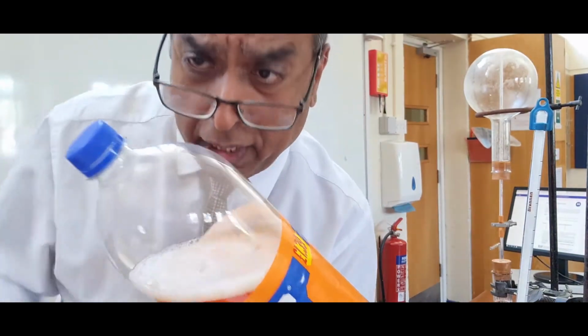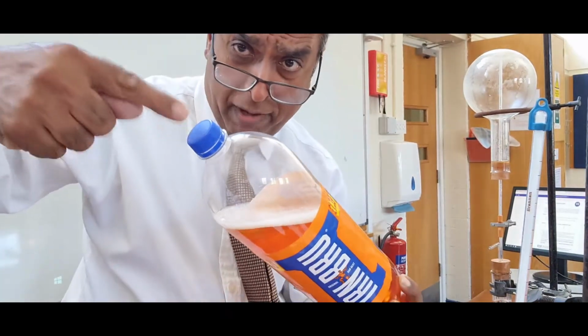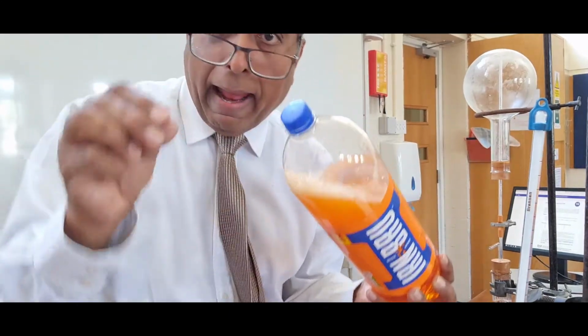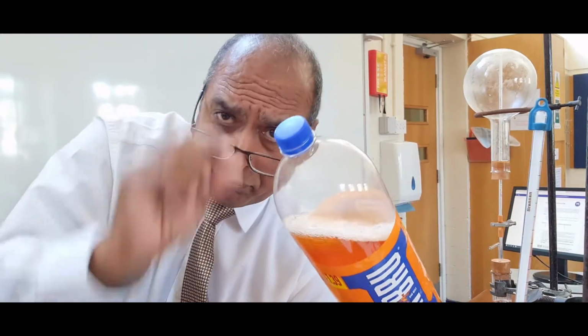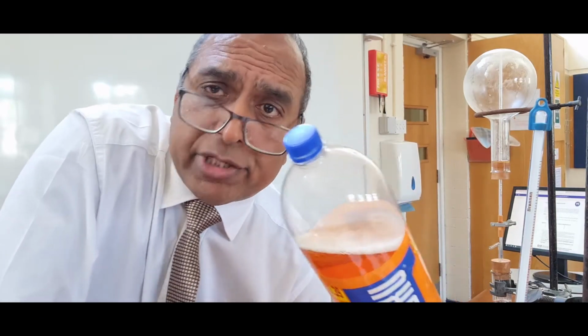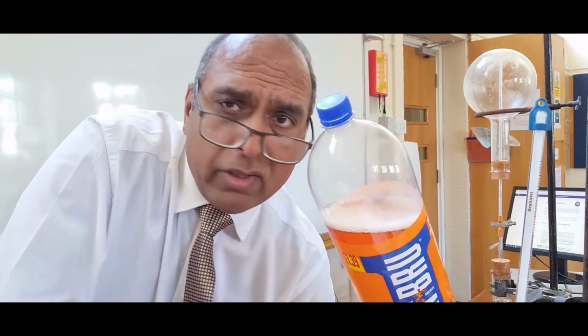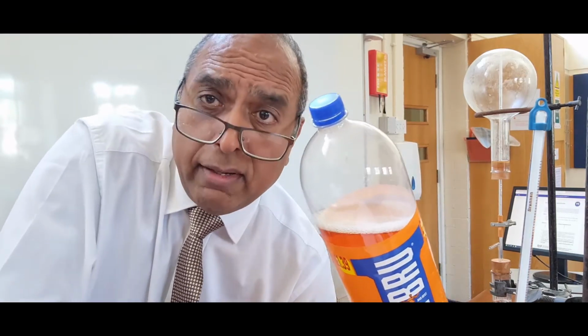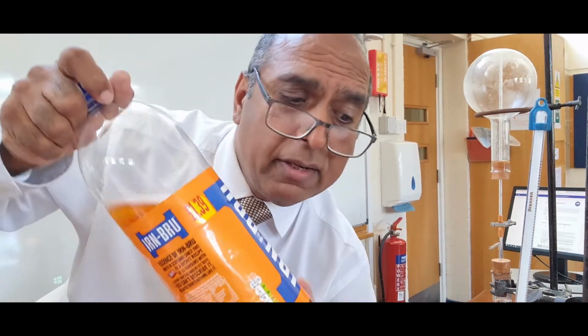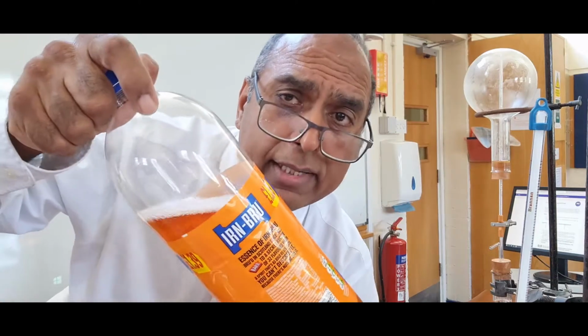We could prove they were carbon dioxide by putting in a cork with a tube, shaking it up and bubbling the bubbles I get through lime water. The lime water would go a white precipitate. The white precipitate would be calcium carbonate, proving the bubbles are carbon dioxide. I'm not going to do that. I just want you to trust me that the fizziness in fizzy drinks is produced by carbon dioxide.